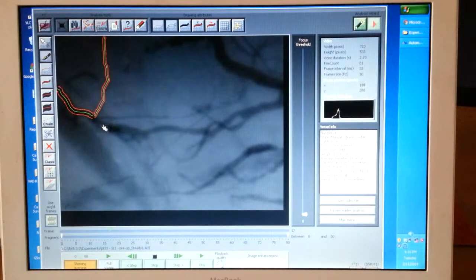You have these two. And then you see, okay, these ones continue on. So you stop at the intersection, and then you draw another vessel, let's say, maybe to about here. There's an intersection here. So you stop, you release, you drag out approximately the thickness. Okay, so now we have a situation where we think that we have two vessels joining together to form one. Unfortunately, there's no way for the software to make two vessels join into one. You can only join one vessel segment to another. So I just choose whichever vessel I think is flowing most smoothly.